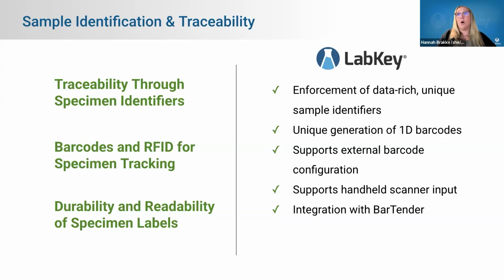Making sure that you also have that unique generation of a 1D barcode, we're able to provide that for you, as well as support external barcodes. So if you're receiving specimens with barcodes already, you can configure a field to be an external barcode field.